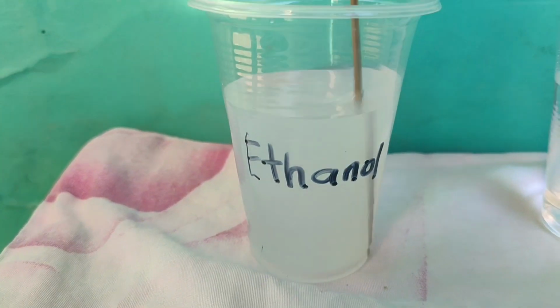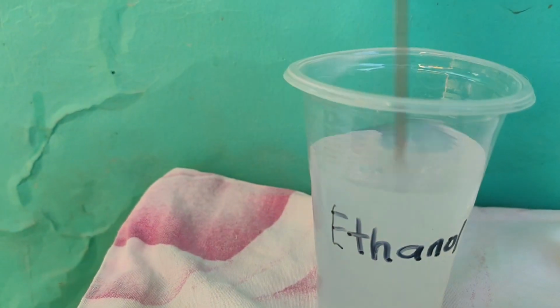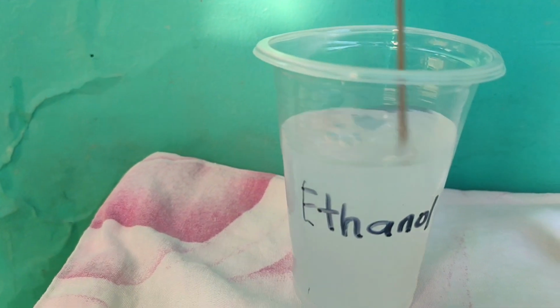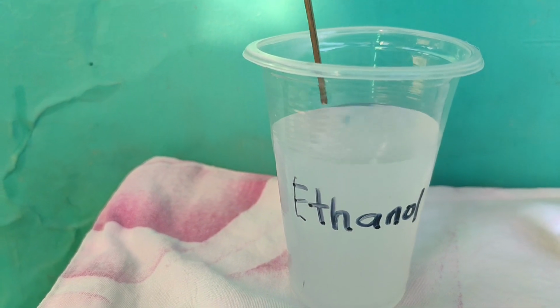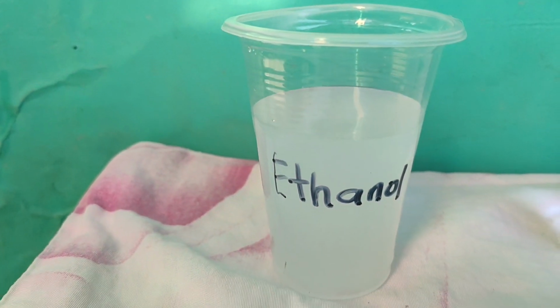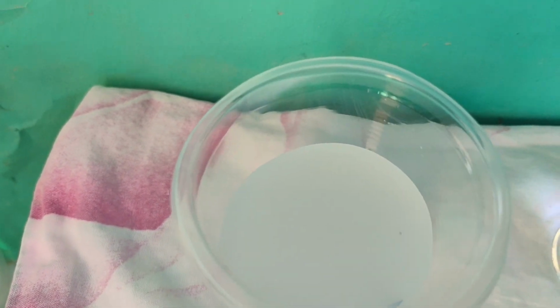I'm using a stick for mixing. As we can see here, the color changes and it's more foggy.